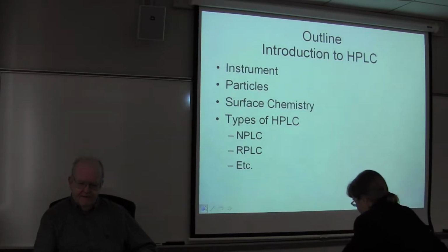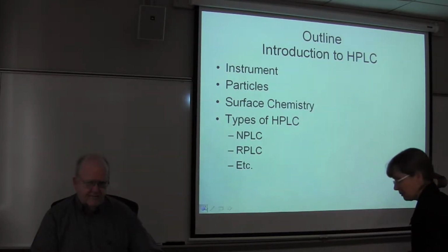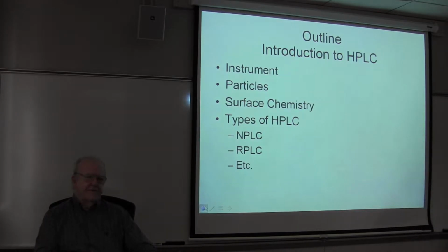We're going to spend a bit more time today on the instrument. I didn't spend a lot of time on the instrumentation for GC, not because it's not important, obviously, but because the instrumentation is really a lot simpler and a lot easier to maintain. And there are not so many great differences between brand A GCs and brand B GCs. They're just not that different fundamentally.